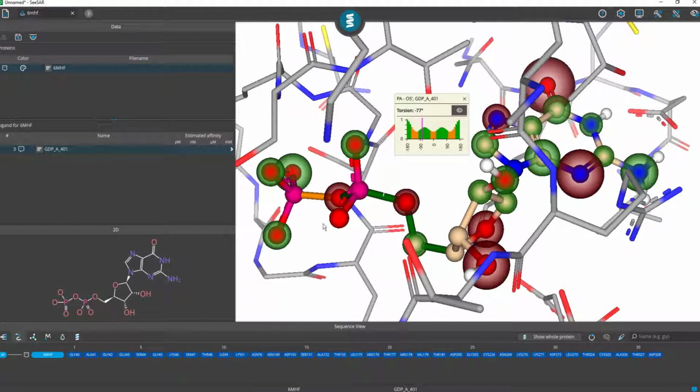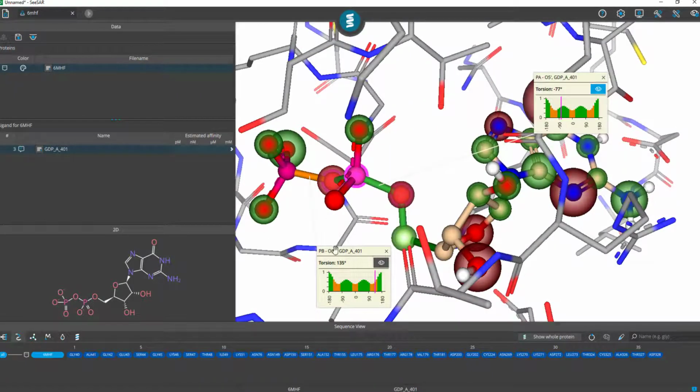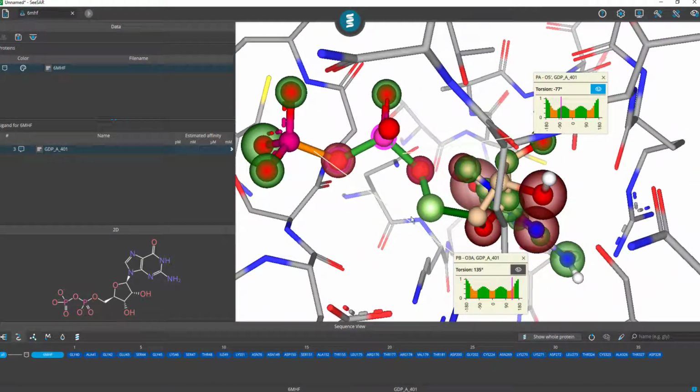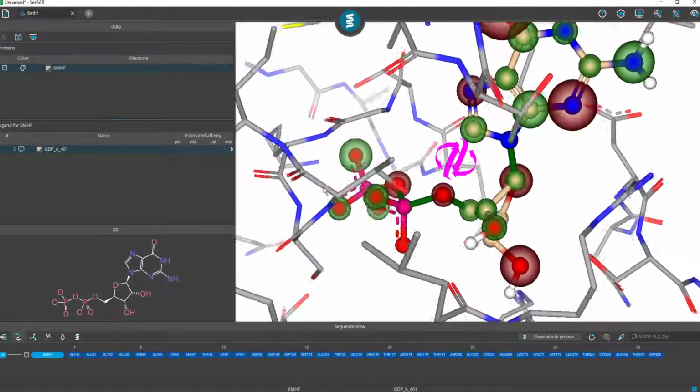On a comparative basis, let's see what this orange torsion has for us. That occurs here in the orange part of the distribution. And switching on these eyes again highlights the 4 atoms that are actually forming the 2 planes that are part of the torsions. So with that one neat trick, we've covered the entirety of labeling, measuring, and seeing more than what meets the eye, essentially, with SeeSAR.